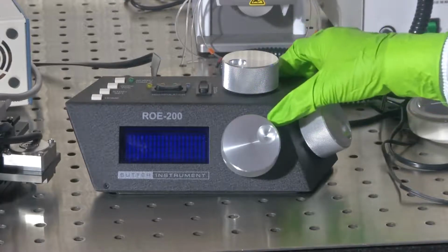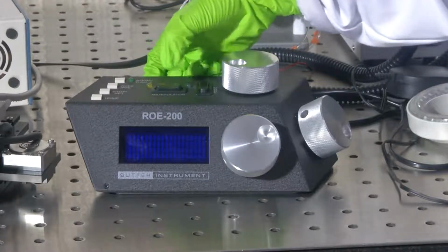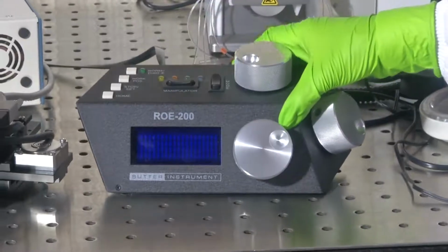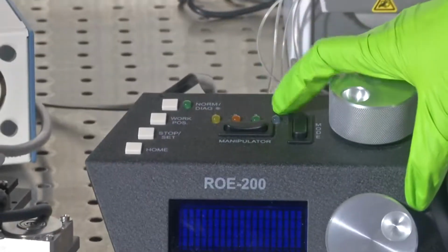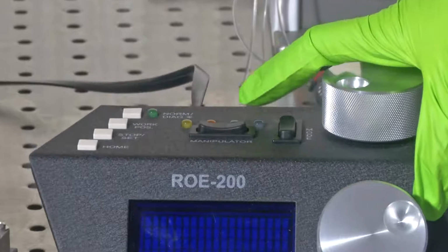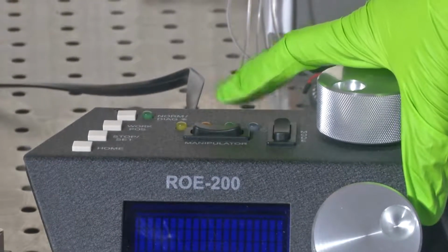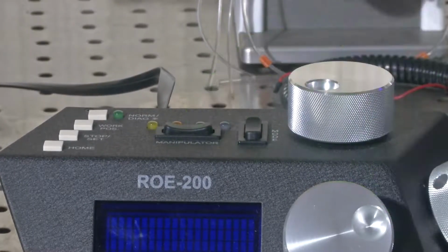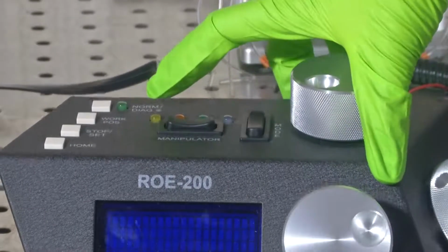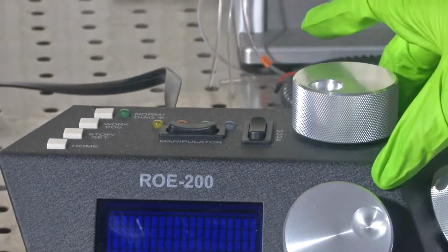The control unit again has an option here called manipulator. Here it says 1, 2, 3, 4. So, the control unit can control 4 manipulators. In our case we have connected it to 2. So, we have 1 and 2 which can be controlled using this.